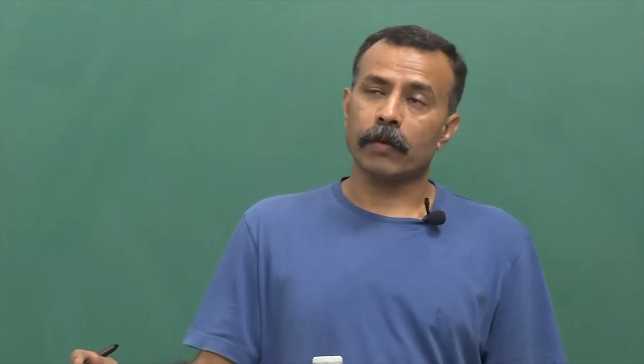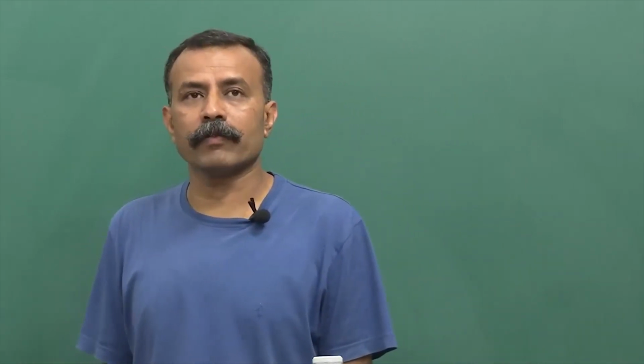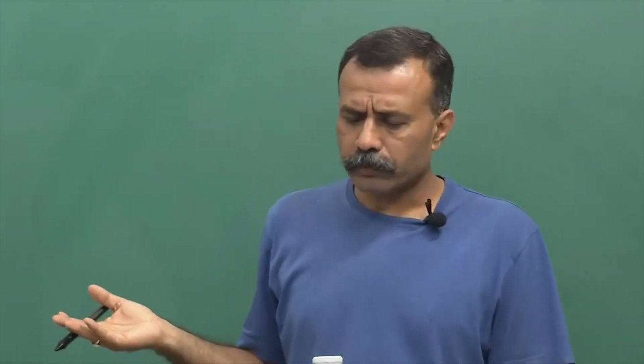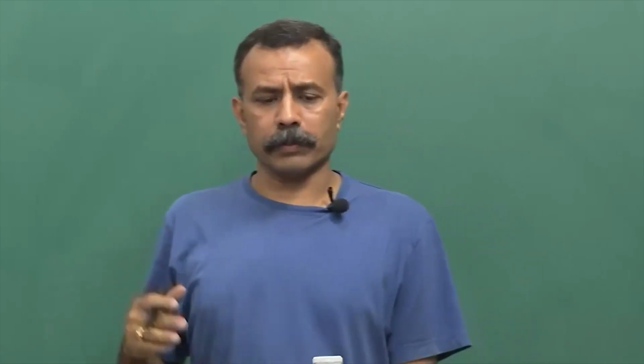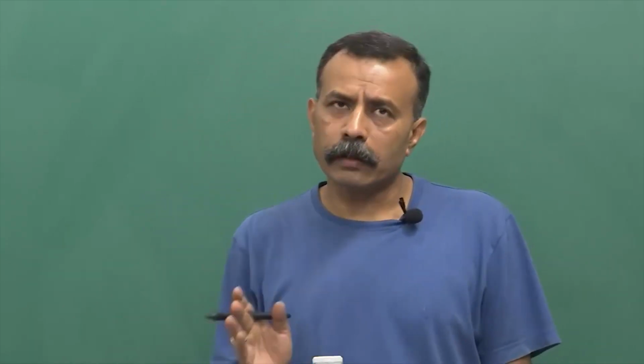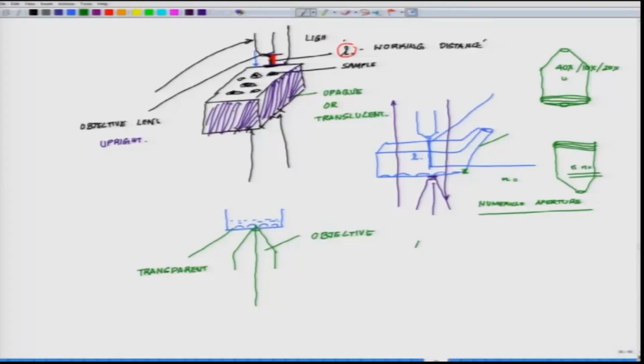They may work on microelectrode arrays and field effect transistor chips. Those are completely opaque systems. You may opt for another version of upright, which is a metallurgical microscope. You may think over that, but just know it's there.